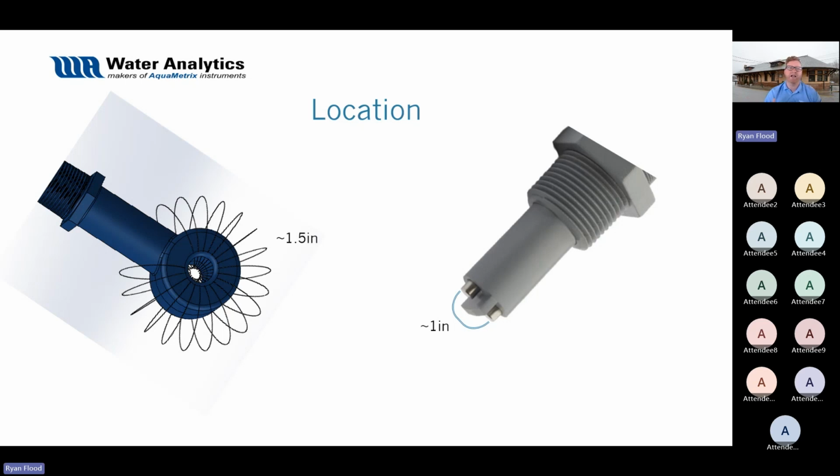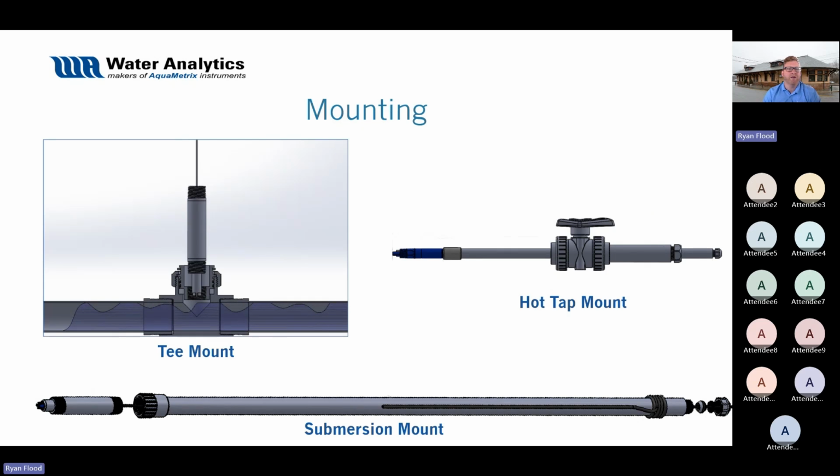But you need to know you need to calibrate around that. So if you were to pull a sensor right out of the box and you didn't calibrate for that, you may need to perform local calibration. Again, something to think about with sensors that you get that are pre-calibrated. You just may need to perform that simple calibration on site, and then you're back up and ready to run again.